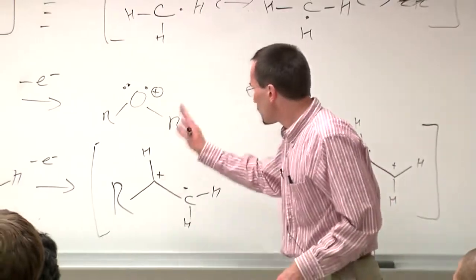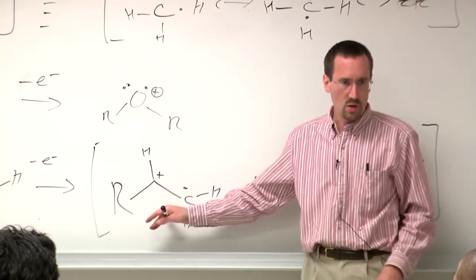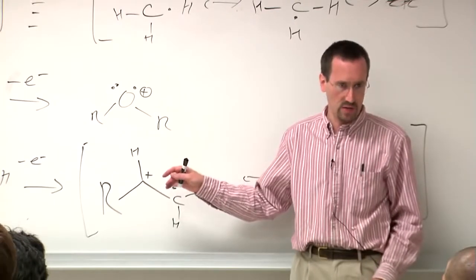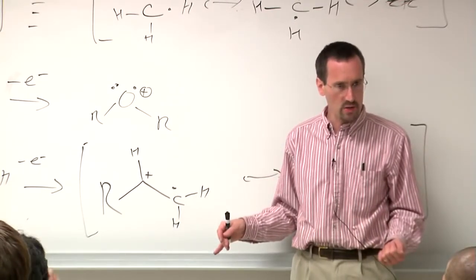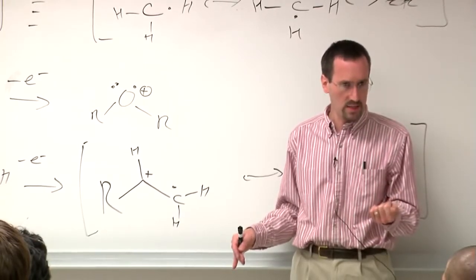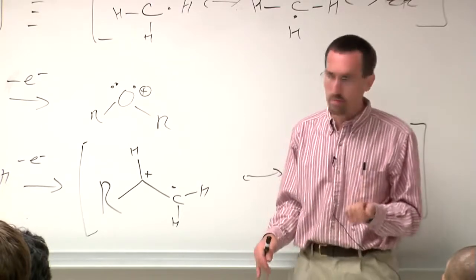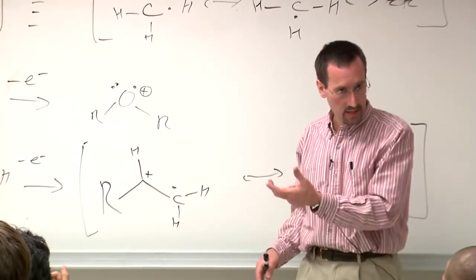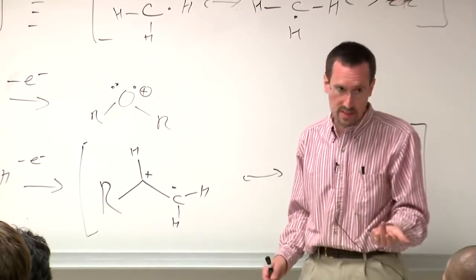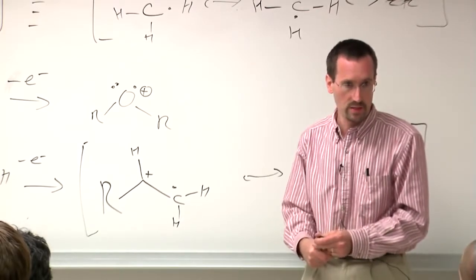When one of these radical cations breaks apart into 2 halves, one half will end up with an even number of electrons and a positive charge. The other half will end up with an odd number of electrons and no charge. And the radical, because it doesn't have any charge, won't be deflected and won't show up and won't be detected, because the detection depends upon detecting an electrical current.